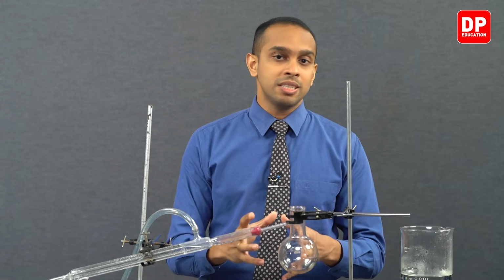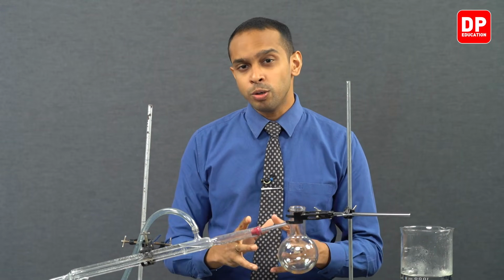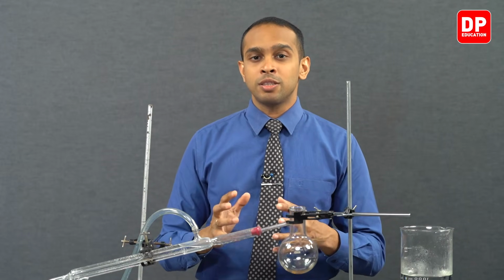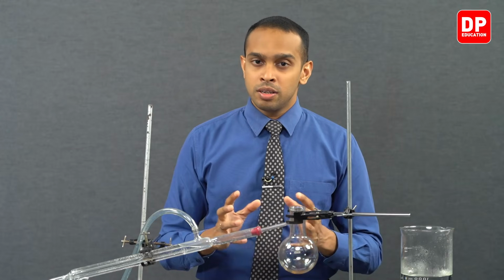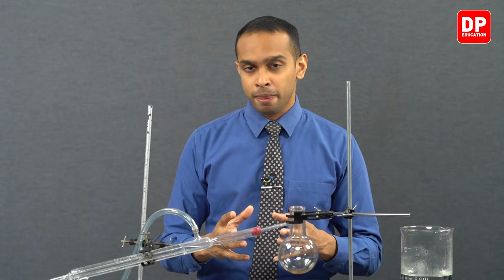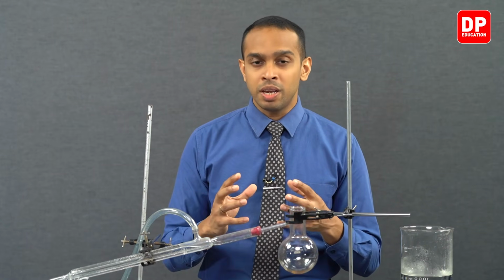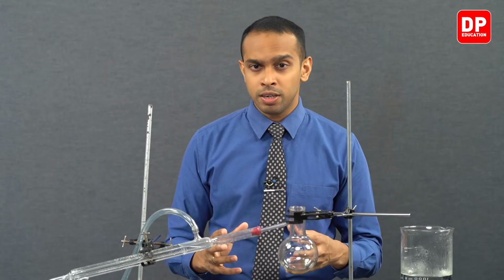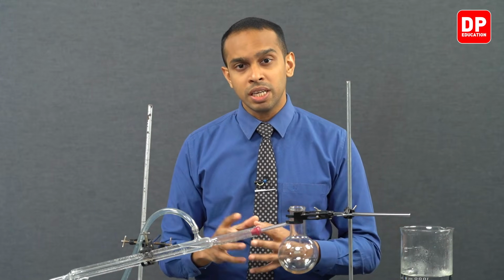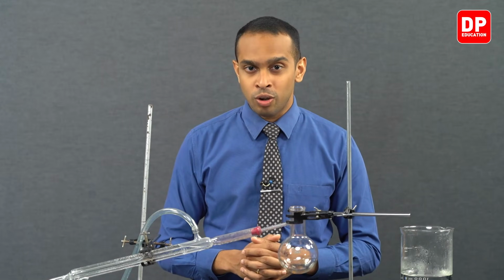So in this particular experiment, we looked at how to extract an essential oil from a plant source. Specifically, we used cinnamon leaves. Depending on which part of the cinnamon plant we extract the oil from, we will get different types of oils. Since we used cinnamon leaves, we extracted eugenol essential oil.